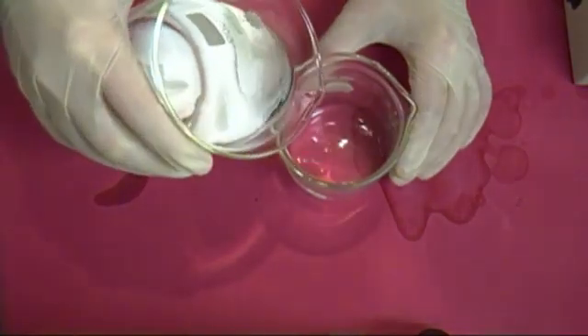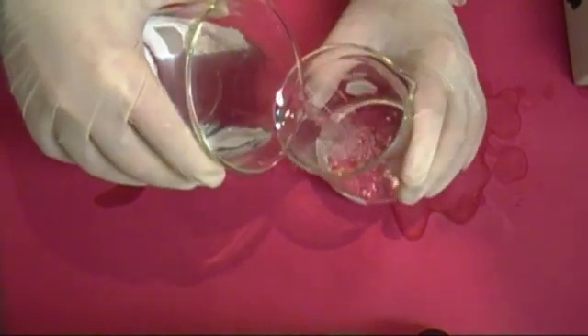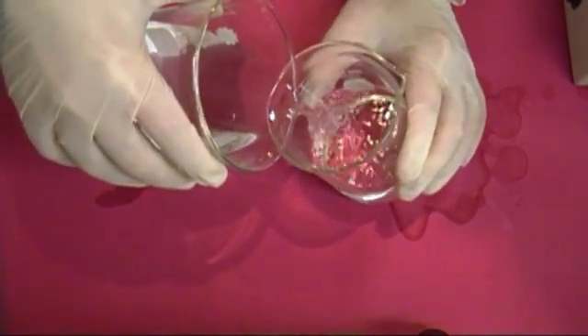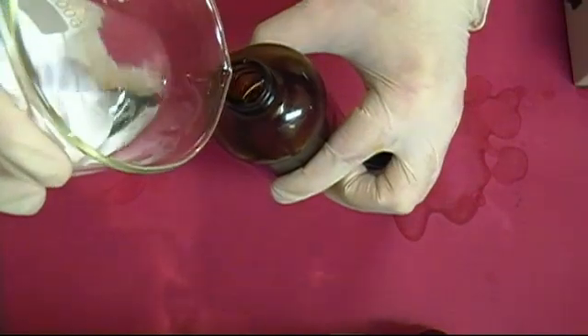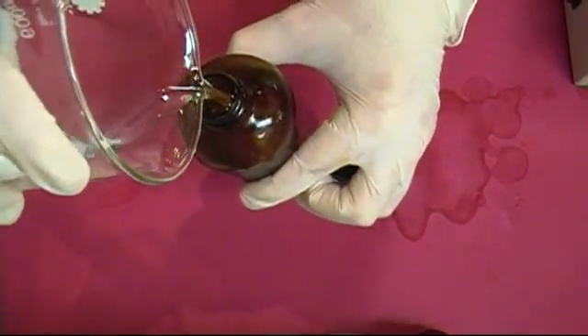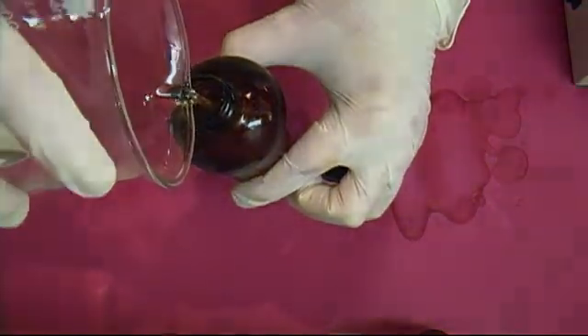Now carefully decant off about 250 milliliters, or 200 grams to be more specific, of the ethyl acetate into a small beaker. We'll be converting this into the hot ice and ethanol. The rest should be poured into a bottle and stored in a cool place. Ethyl acetate is a very useful solvent, and we may be using it in future videos.